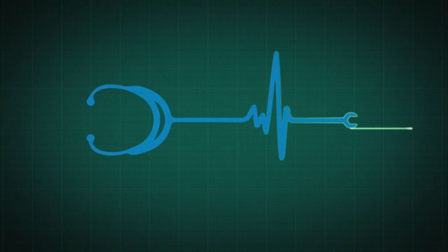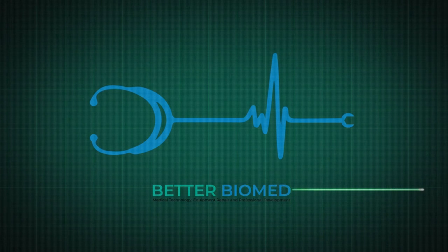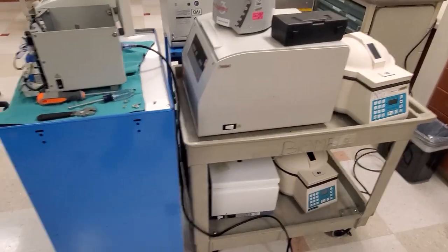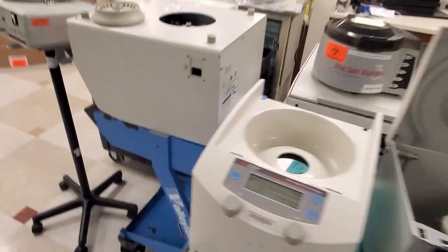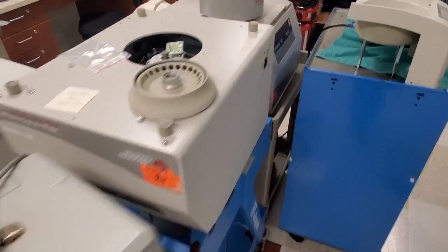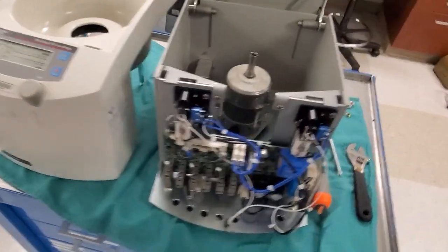They come in all shapes and sizes and unfortunately it appears they're all broke. So today we're going to take a look at centrifuges. It must be my lucky day because I have all different types of centrifuges and a light source down here for repair. Let's take a look and see what's going on with some of these centrifuges.